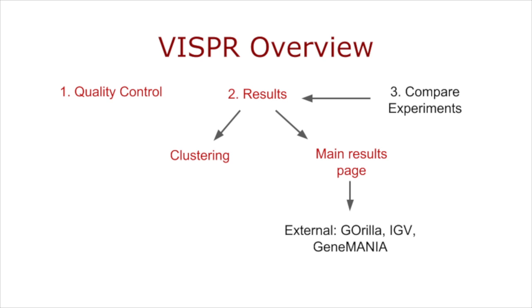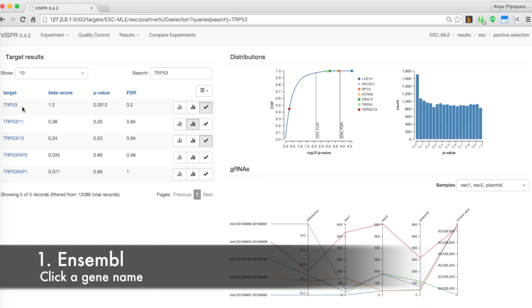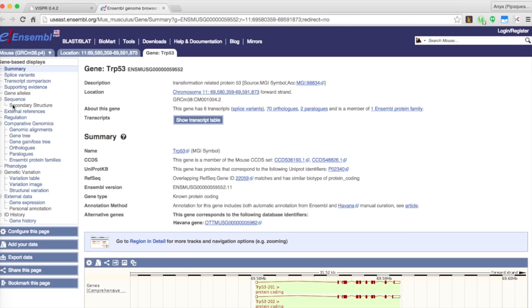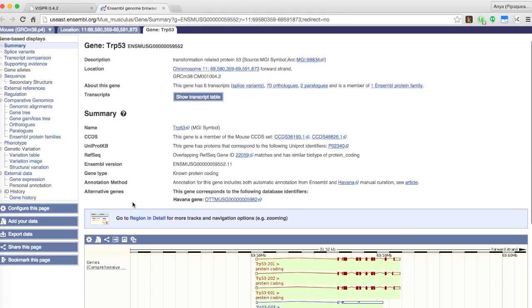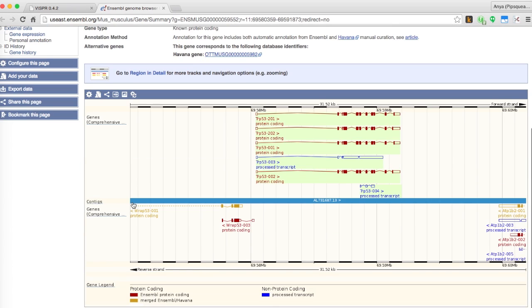Visper also incorporates existing third-party tools. First up is Ensemble. Clicking on a gene name will lead you to the gene's Ensemble page where you can explore its transcriptional and other information.